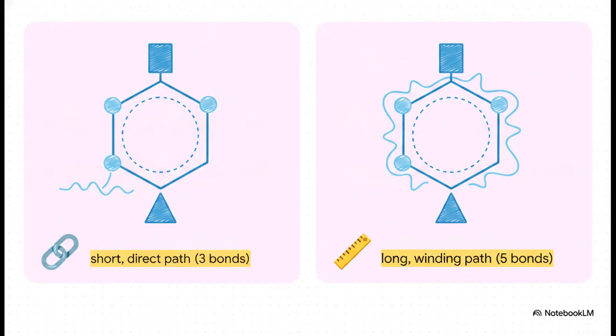Now, what's really interesting about this slide is how simple physical distance just destroys magnetic equivalence. Take a look at a para-di-substituted benzene ring, where the top and bottom substituents are different. You see that plane of symmetry right down the middle, right? So the proton on the top left, HA, and the top right, HA', are chemically equivalent. But look at their relationship to the bottom left proton, HB. HA couples to HB across 3 bonds. But HA'? It has to couple to HB across 5 bonds, all the way across the ring.